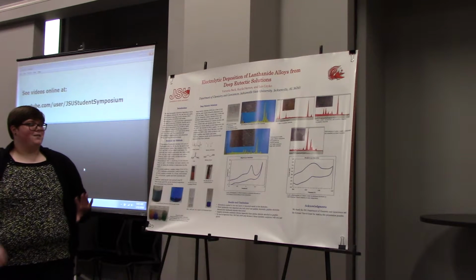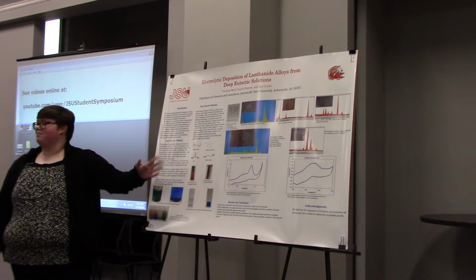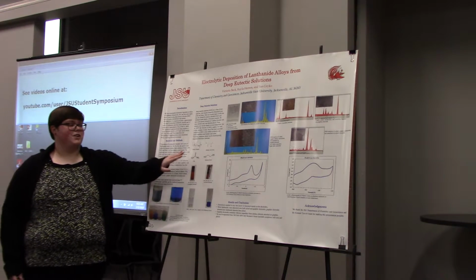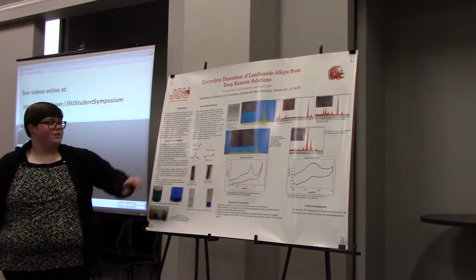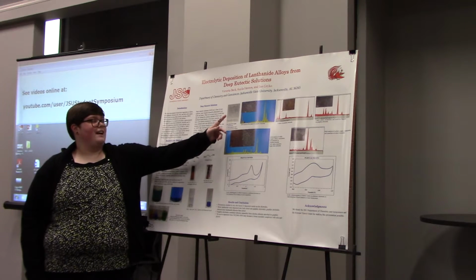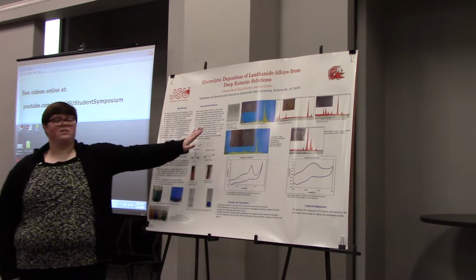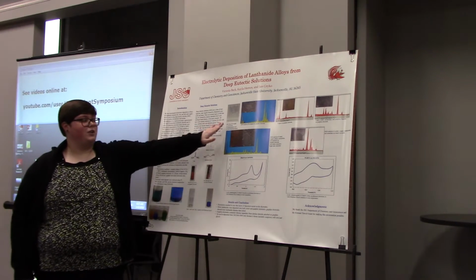So now I'm going to take a minute to talk about all these pictures up here. Hopefully all of you can see most of them. These are just structures. This is choline chloride, malonic acid, urea, and ethylene glycol. These are our solutions here. This is choline chloride with urea, malonic acid, and ethylene glycol. Hopefully you can all tell, especially those in the back, that these are clear.